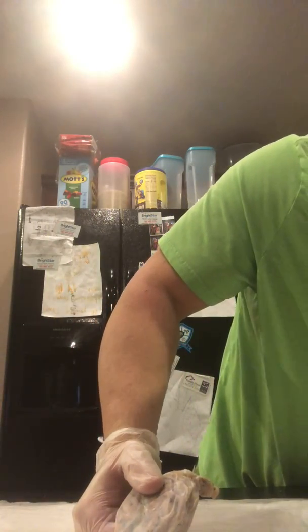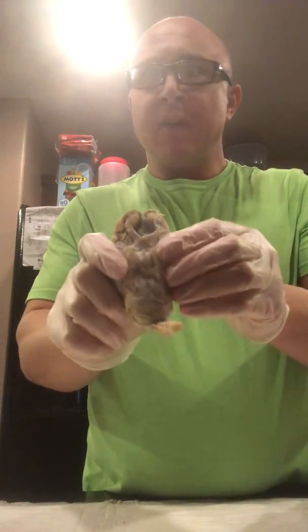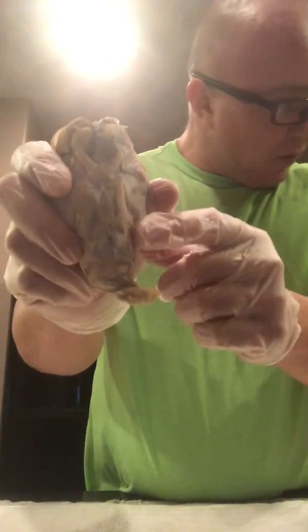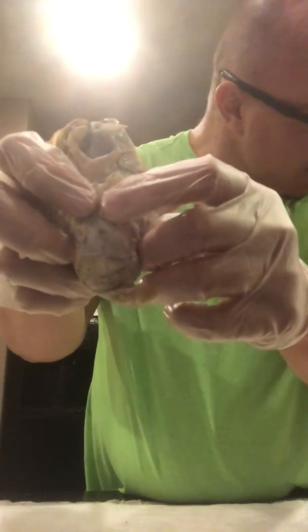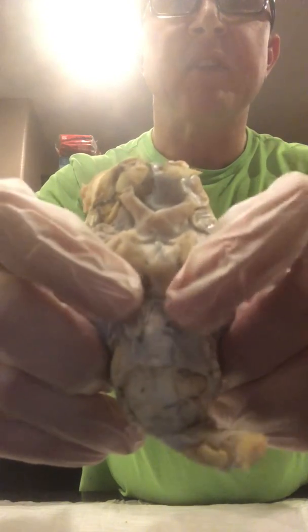The abducens, if visible, that one I think is roughly below those. Right inside, it's going to be the middle here. It's going to be roughly right here, coming off of the stem slightly here.